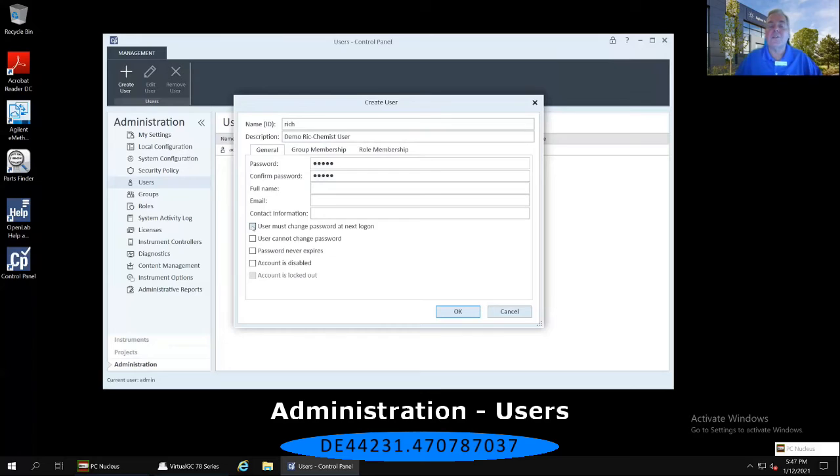Now, here's another thing to please keep in mind. I am asked often by managers and supervisors, what happens if I don't remember the password? I don't remember the username and password. My administrator of the system, when it was installed, has since left the company. Is there a back door where I can break into the system? The answer to that is an unequivocal no.